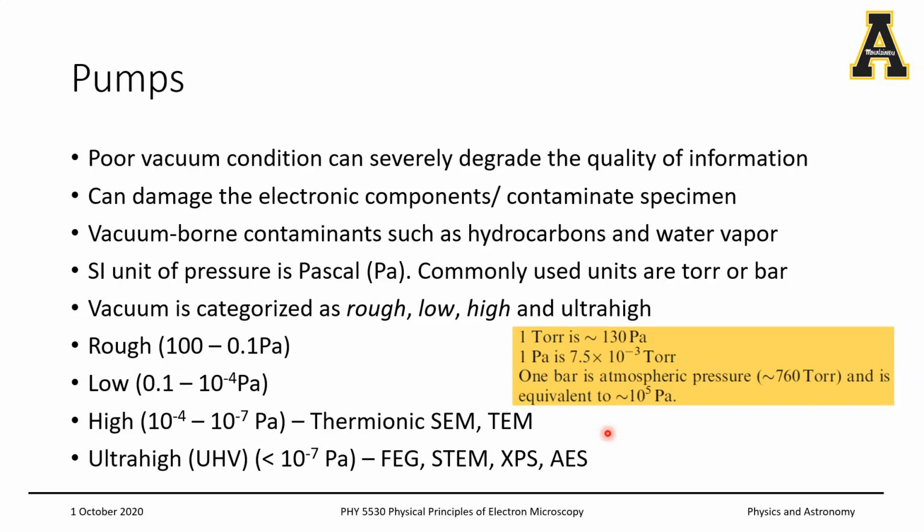So the whole idea of this lecture is to make you familiar with the different kinds of pumps and the vacuum lines and systems. The basic principle of how a vacuum pump works has a lot to do with mechanical engineering, electrical engineering. Also, a lot of thermodynamics and kinetics go into understanding and optimizing the molecular flow of atoms and gas molecules.